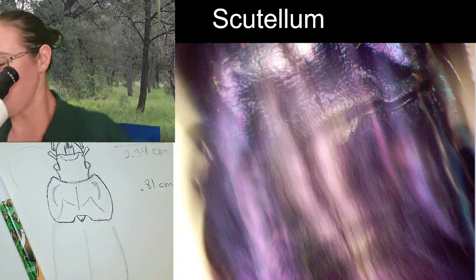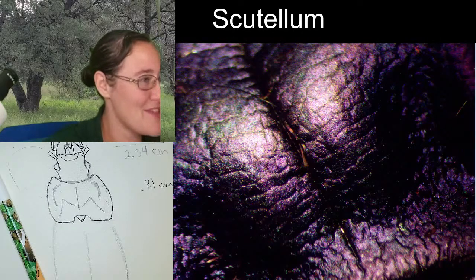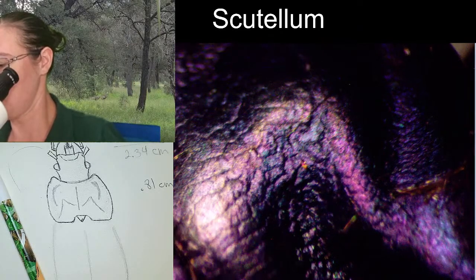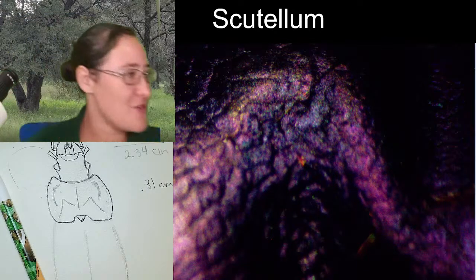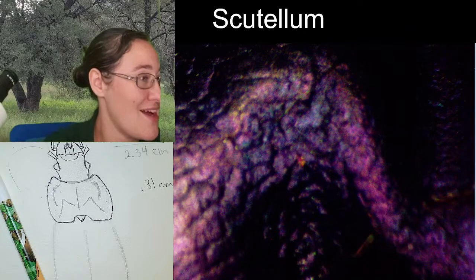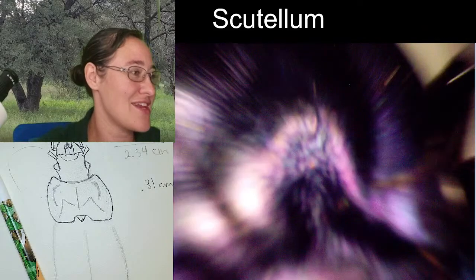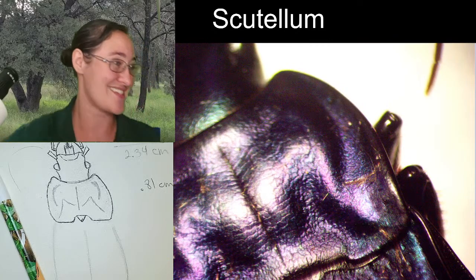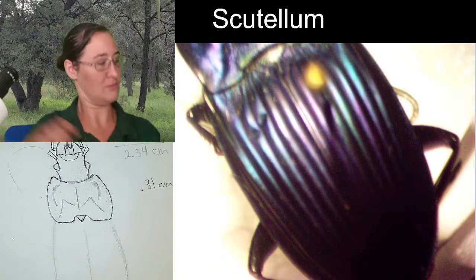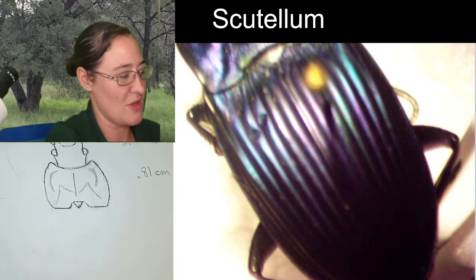And I did want to zoom in on the pronotum and show you this texture because it's really cool looking. Look how cool that is. I think that it looks almost like scales. It almost looks reptilian on this pronotum here. And if you zoom in far enough, it almost starts to look pixelated, but it's not pixelated, because when I look at it under the microscope, the texture looks like individual little colored pixels. I can only imagine that that is the crystalline structures that create the metallic colors. Alright, because the pronotum's changed size, I'm going to be making my beetle just a little bit bigger, so I'm just going to go ahead and get rid of that right now.